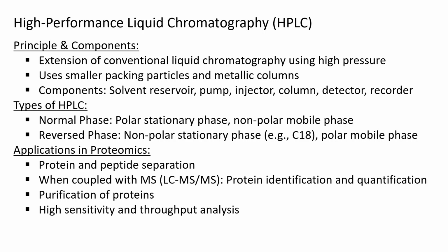Coming to the applications in proteomics, these are useful in protein and peptide separation. When coupled with mass spectrometry, protein identification and quantification can also be performed. HPLC can also offer purification of proteins and high sensitivity and throughput analysis.